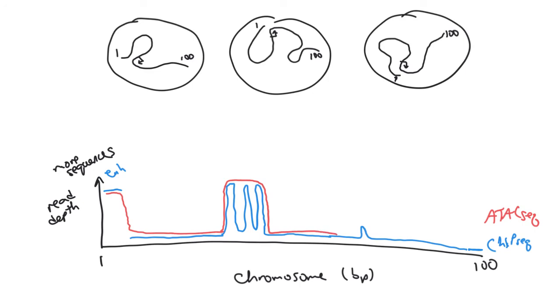And in this case, when we get to the rare cell that might have some other sort of three-dimensional structure, we wouldn't necessarily see that association because this could still all be heterochromatic. So in that case, actually, I should go back and correct myself. If it's heterochromatic, that means we wouldn't have seen a ChIP-seq peak there, because ChIP-seq also deals in heterochromatin state. So we would see something like that for ATAC-seq as well.